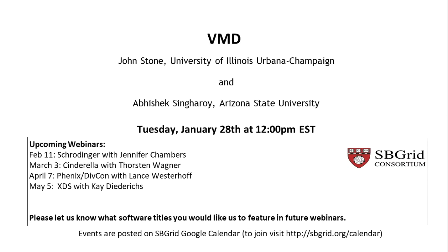I think the last driver came out in April, and after that it's going to be gone. So this leaves structural biologists without their 3D visual tools to look at density in the range where cryo-EM lives, this 3 angstrom, 4 angstrom, 5 angstrom area.